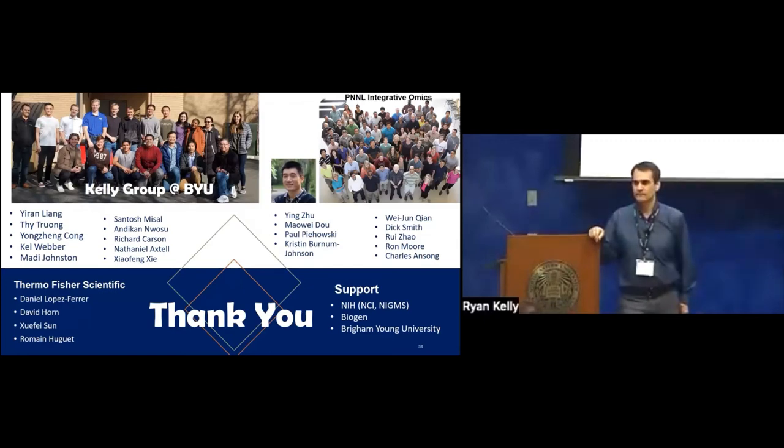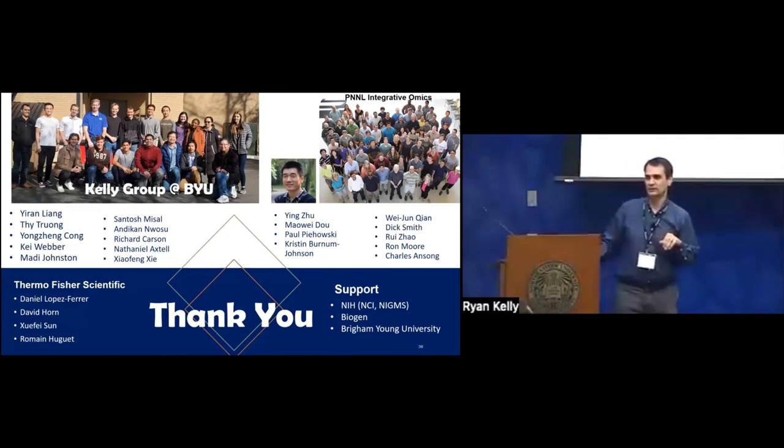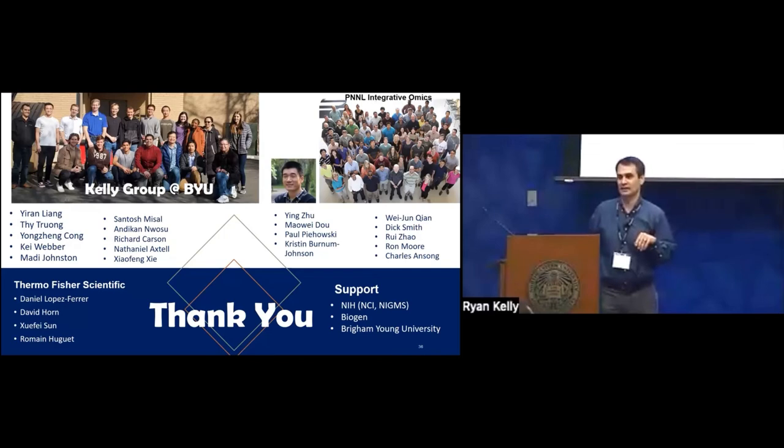Sure. I'm Erwin Skull from the Technical University of Denmark. Thanks for a beautiful talk. I think you keep pushing the boundaries of everything we do, and it's fantastic to see. I'm very curious about the SILAC TMT multiplexing and how many missing values you're expecting or experiencing. Yeah, we need to look at that. They do increase, but the coverage decreases, though not that much, about 10-ish percent. That's kind of what we were seeing with the missing values too. But yeah, there are going to be some increase in missing values.